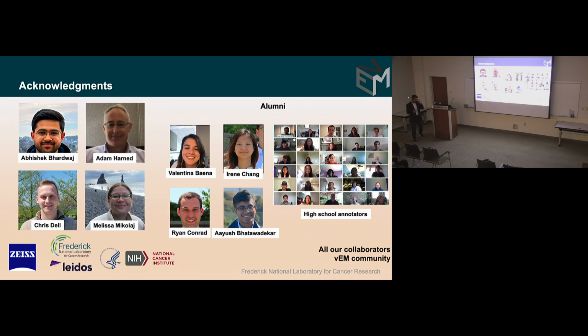The way I like to think about it is, let's say you have 5 people walking on a beach. If you were to do a semantic segmentation, you would get sky, water, sand, humans. If you do instance segmentation, you'll get 5 humans. If you do panoptic segmentation, you get 5 humans and sky, water, sand. So Panoptic DeepLab actually spits out both the semantic segmentation as well as the instances.